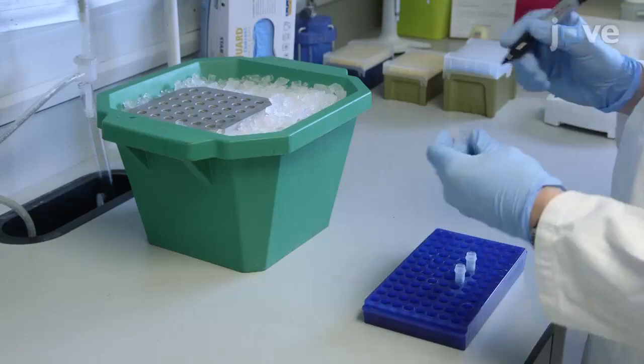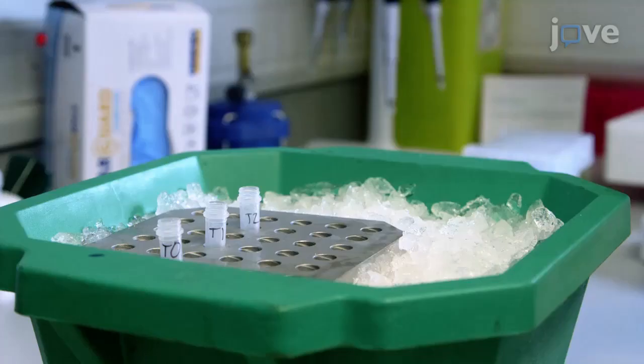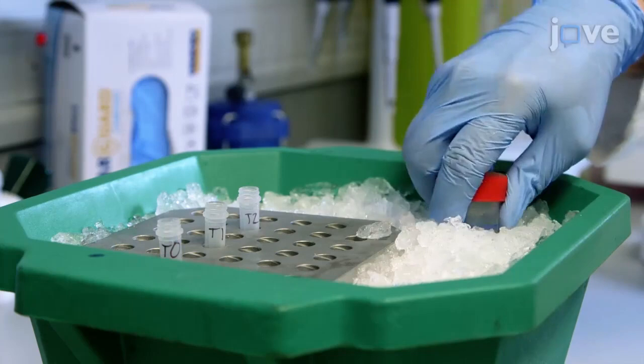Next, label 2 milliliter tubes for long-term storage of the samples and place on ice to cool. Add zirconia beads to the 2 milliliter tubes. Cool at least 1 milliliter of water per sample on ice.